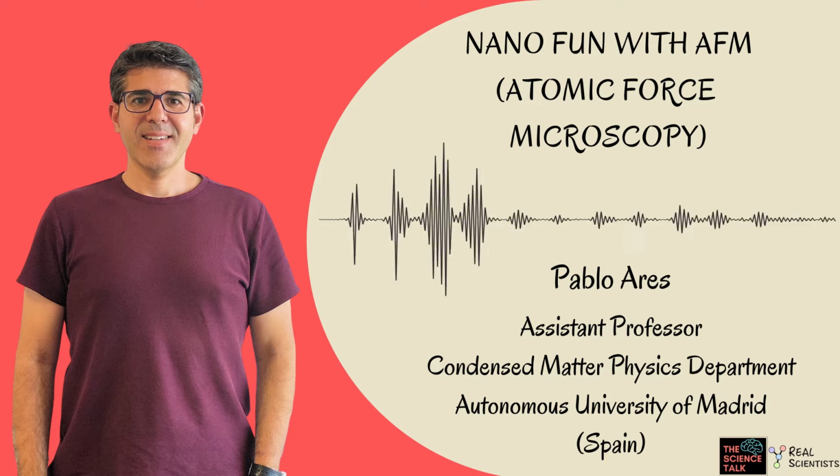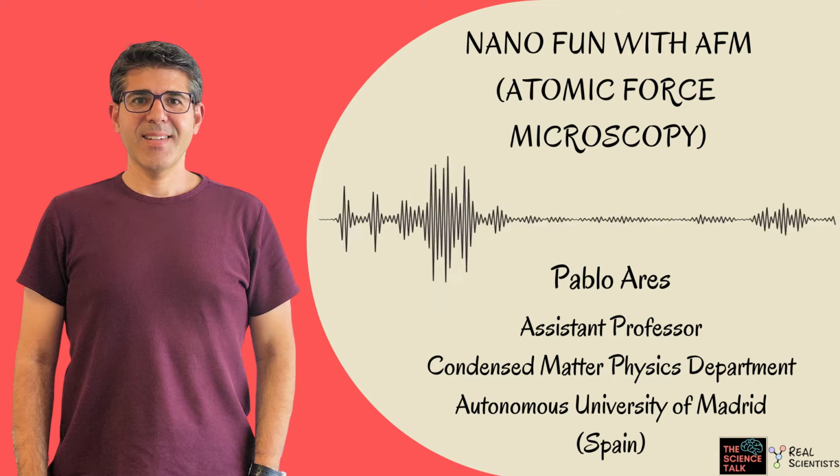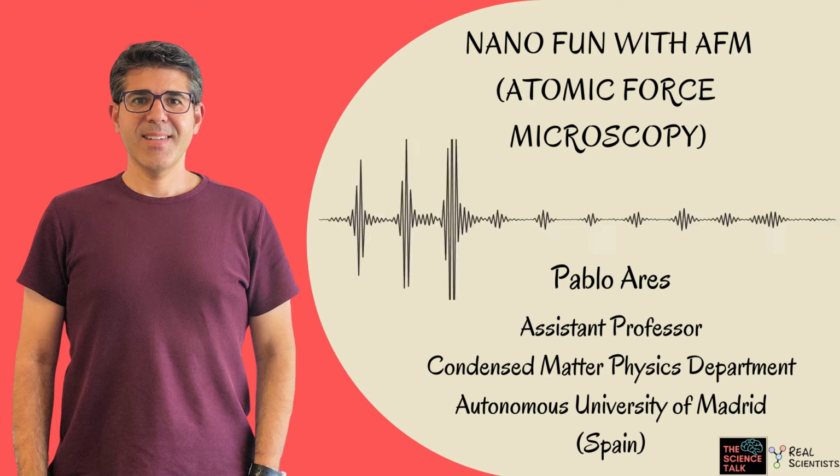My research consists in using AFM to study different low-dimensional systems. Part of my research also consists in the technique itself. I love the AFM technique, so I like to try new things, develop things. We have a lot of experience and background on that, as I will explain later.